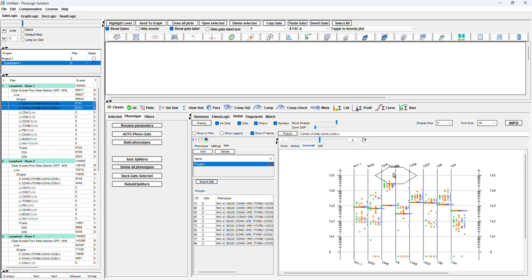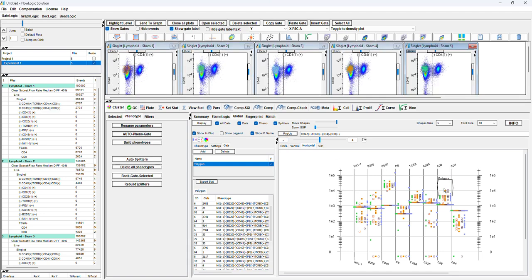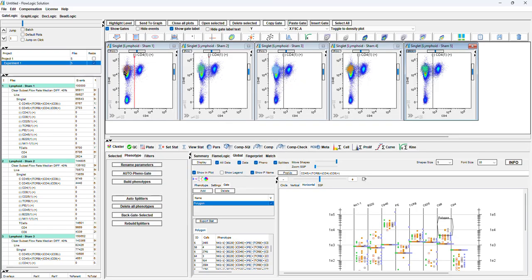And when you find something, you can obviously reshape the gate. For example, say, okay, I want just CD8 high for all, but I want to visualize before I go and extract. You see, it's giving you the visualization tool, and you can visualize where this data is.